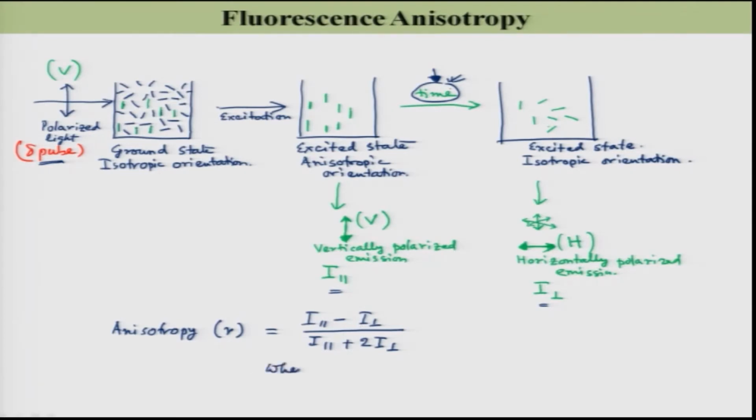when I parallel equals I perpendicular, this R is going to be equal to 0.